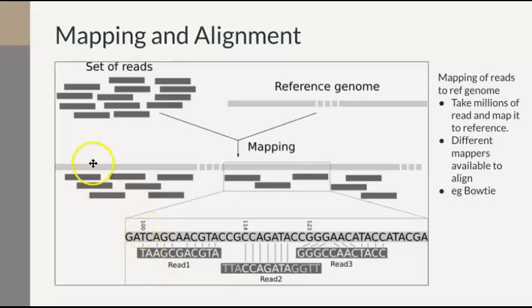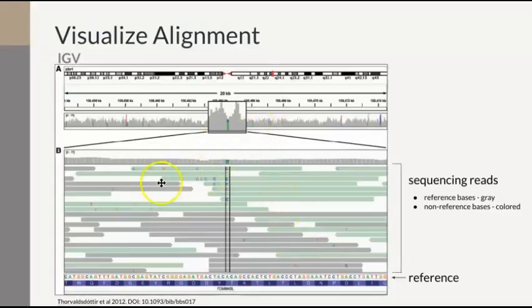So you're going to have all these reads, and you're going to map it to your reference genome, and you'll end up producing this consensus read. See how here we have these reads, and we're trying to build what the consensus would be between them. But you have these reads here that came from your sequencing library. Here, what you see is a bunch of these reads. We're piling them up, and you can see the pile up here.